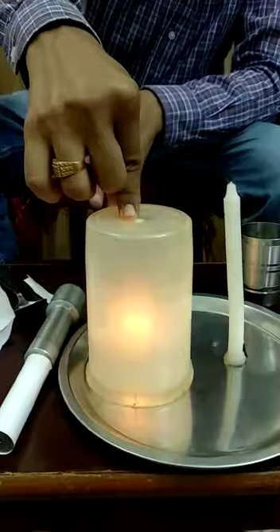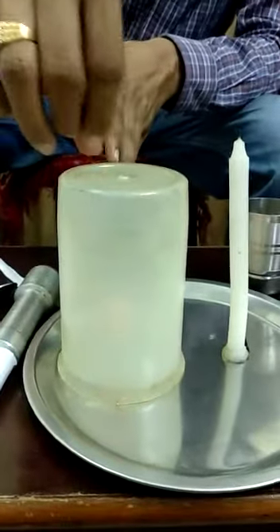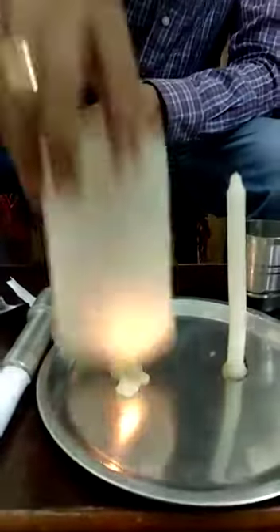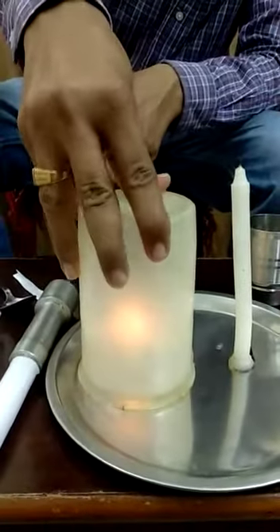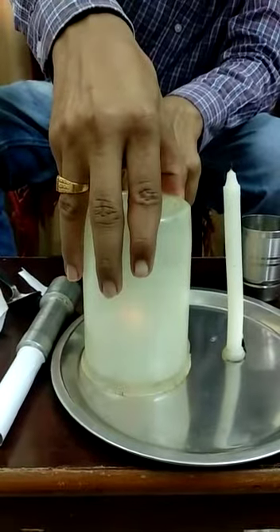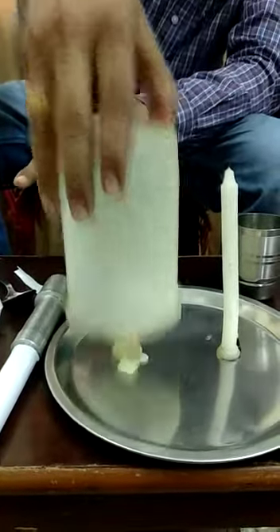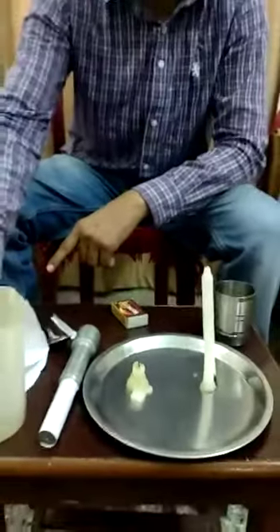As this is a big beaker, it has a lot of oxygen in it, and you can see now the candle is blown off. Still it has a little bit of oxygen, and now you can see this candle is blown off. So this clearly indicates that oxygen is essential for burning.